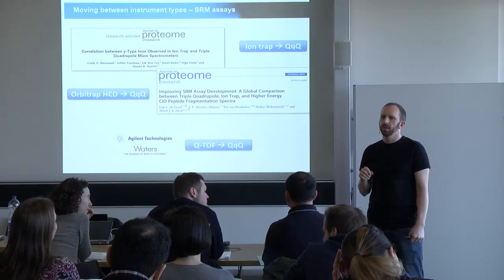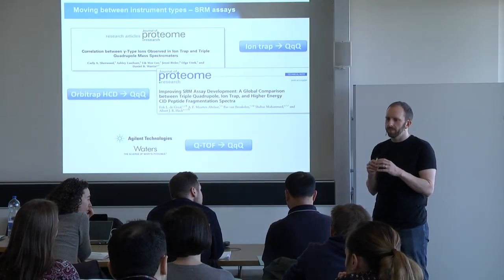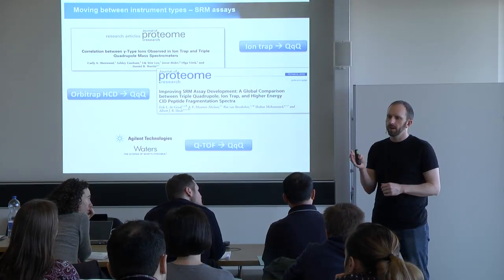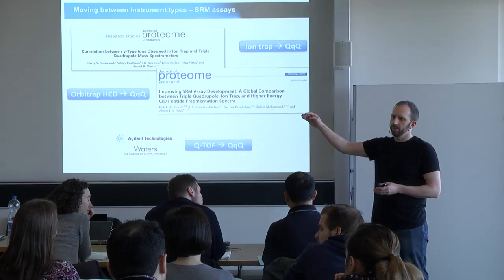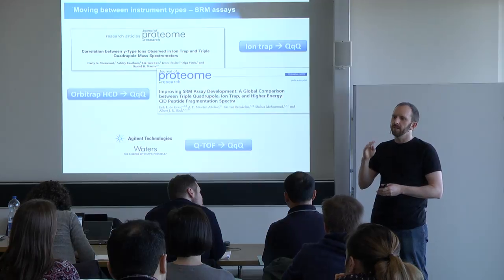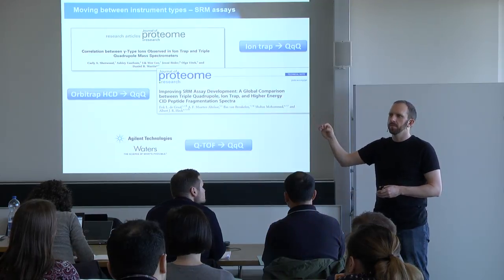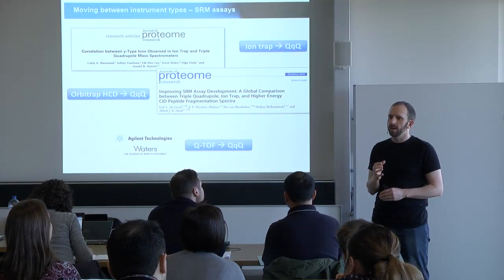You can either take a representative sample and inject it many times, and Lukas from Biognosys has done some work on this, who will talk on Friday, to say somewhere between 6 and 20 injections you get saturation, right? If you inject the sample over and over again, because of the stochastic sampling of DDA, you don't get it on the first one, but if you inject it enough times you eventually get to saturation. Whether that's the best library, so that's a good start.